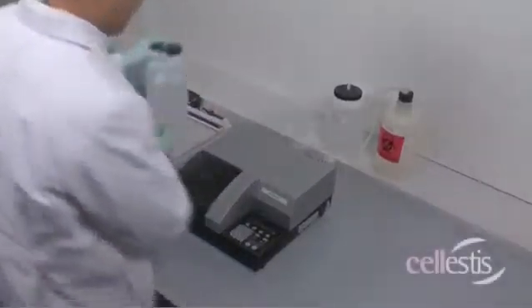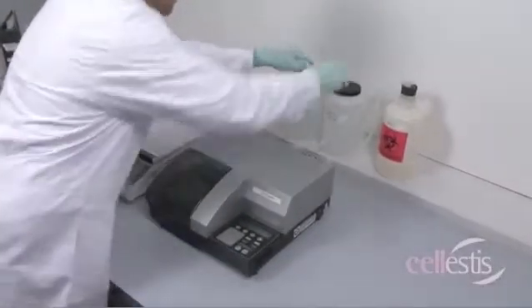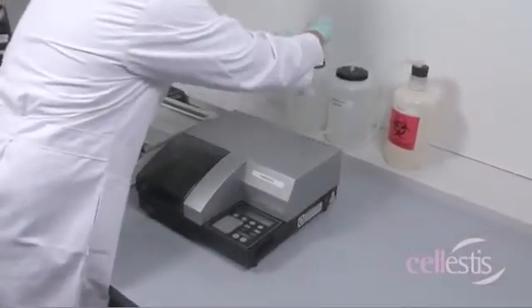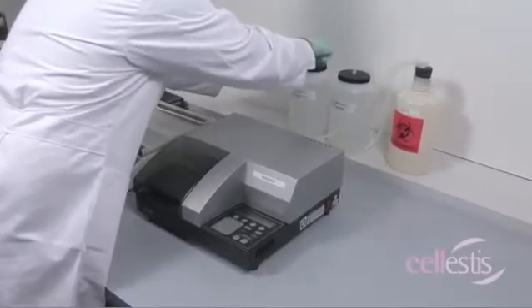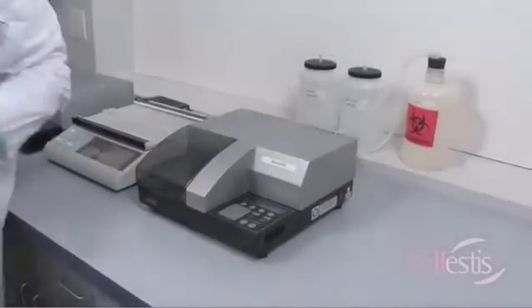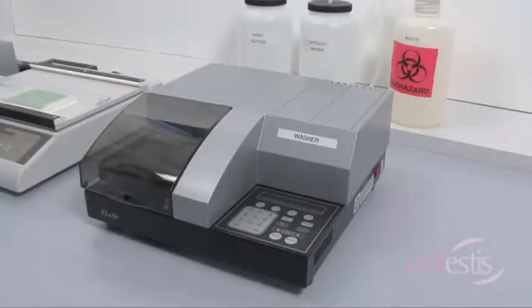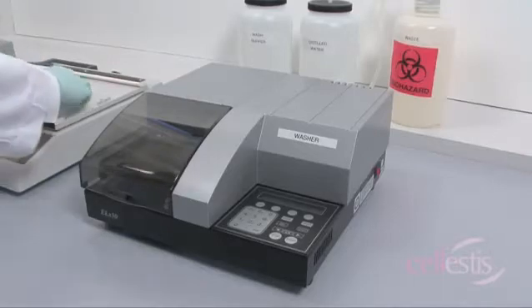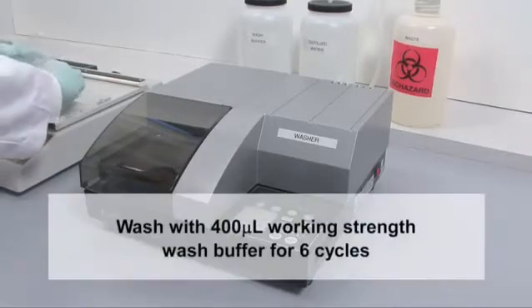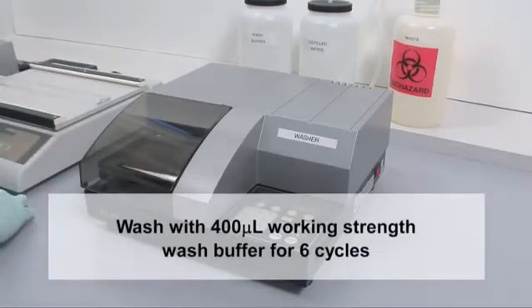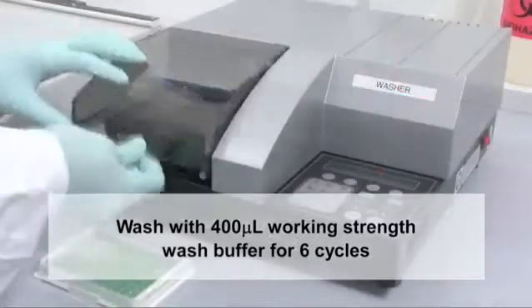Thorough washing is critical to proper ELISA performance. Washing can be performed either manually or by using an automated washer. After the incubation, wash the plate with 400 microliters working-strength wash buffer for at least six cycles.